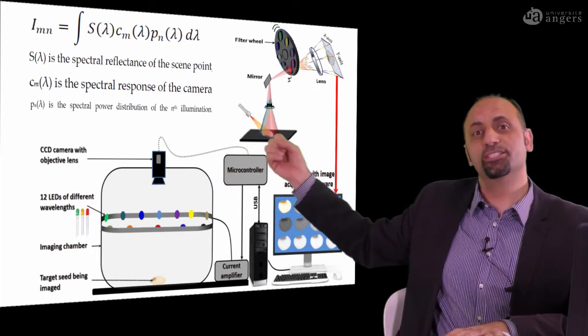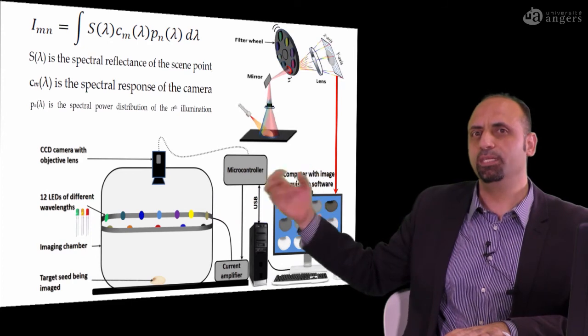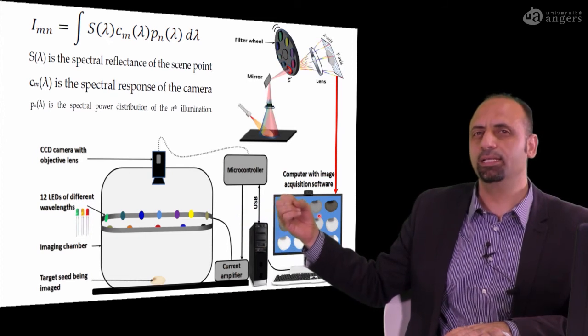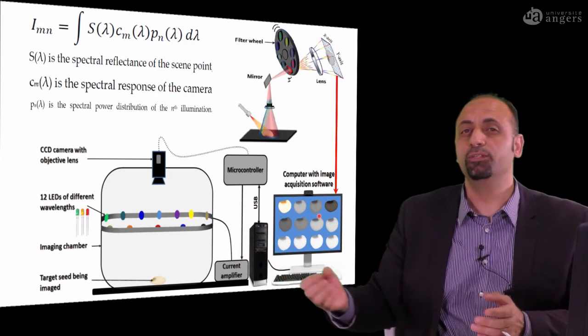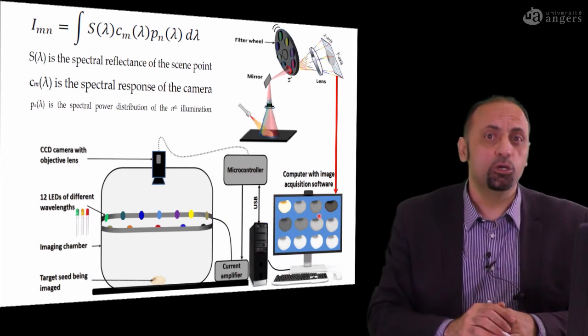As you see here, this system is very promising, and I believe in the future it will be very efficient and also very cheap. You don't need high-tech and expensive electronics, because if you have some very cheap and available LEDs, you can even build this system by hand. This is illumination-based multispectral imaging.